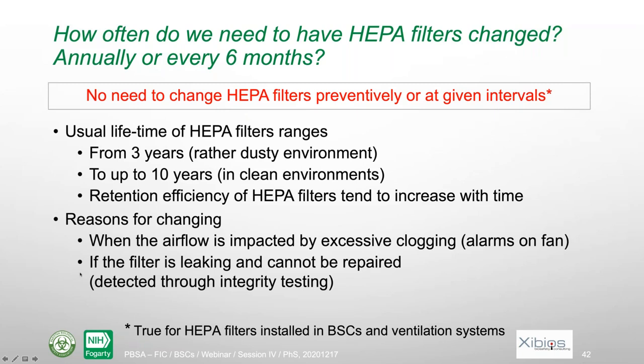The other condition in which you need to change it is if the filter is leaking, and if the filter is leaking, it can only be detected through the integrity testing, which is done during recertification. So to the question, how do I know if my HEPA filter is still operational from a leak point of view, the only way is to do some integrity testing. There is no way to do it by yourself. It's not an easy check. You need to scan it and so on. So you need a recertification and you need the right apparatus for that.